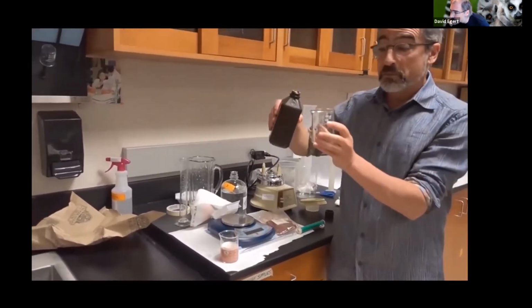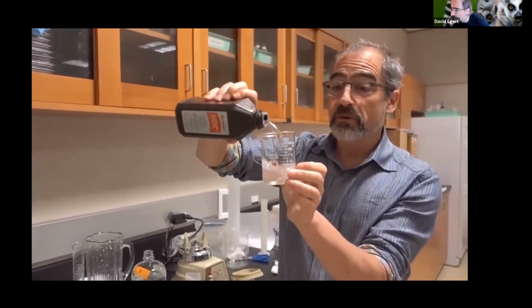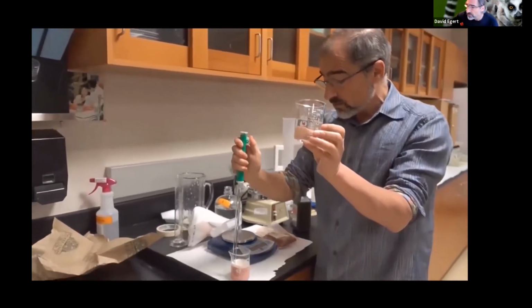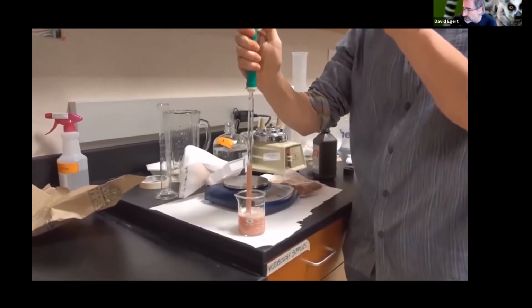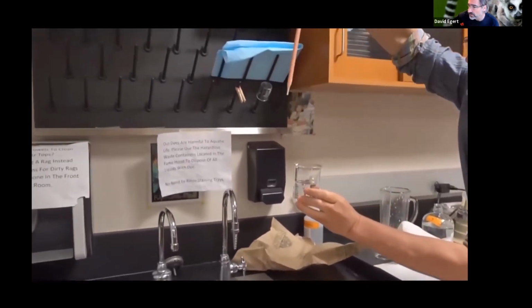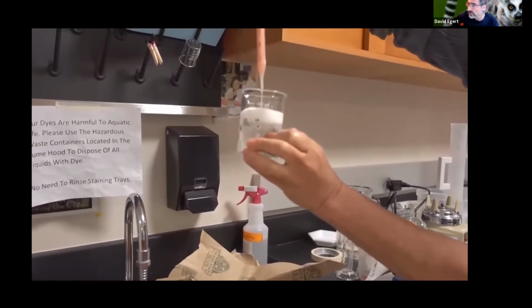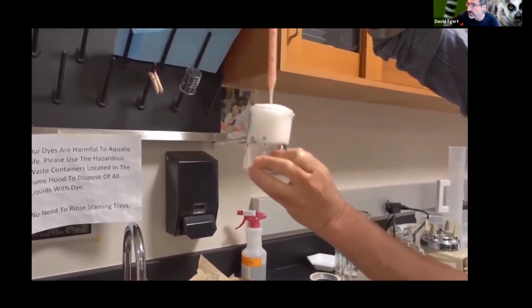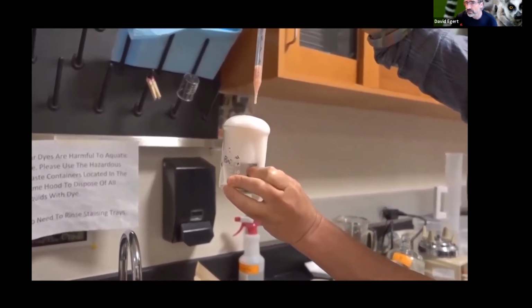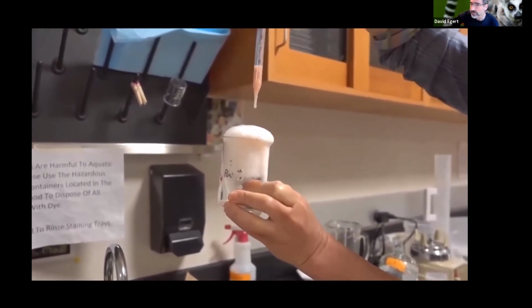The proof would be, let's take some hydrogen peroxide here. Pour some hydrogen peroxide into a beaker. Let's get some of our liver enzyme extract here and add it in, and let's see what happens. Got a good view on that? Here we go. I definitely see the enzyme breaking down hydrogen peroxide as evidenced by the production of the bubbles here.